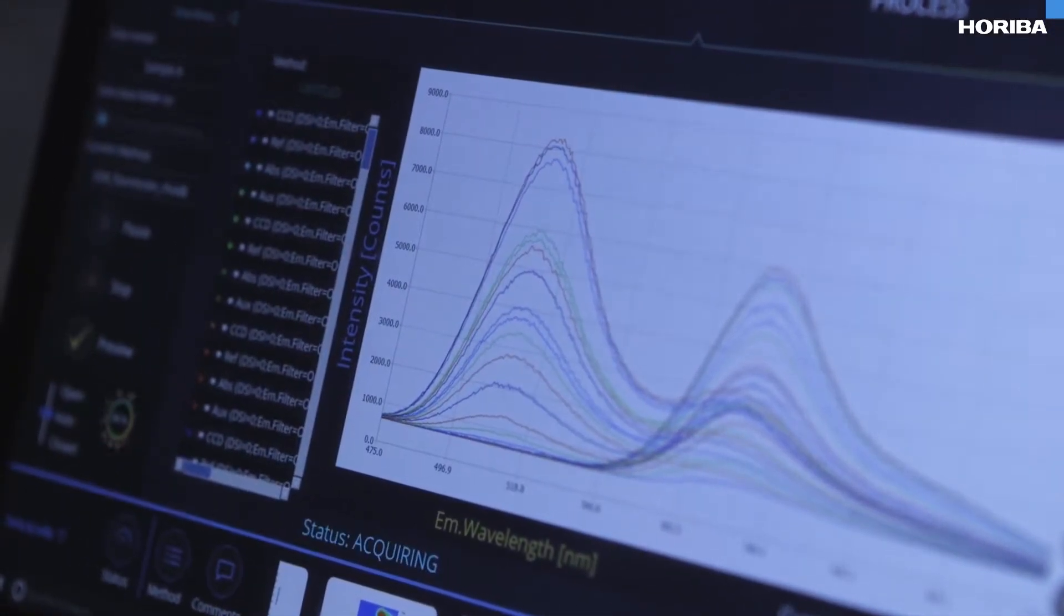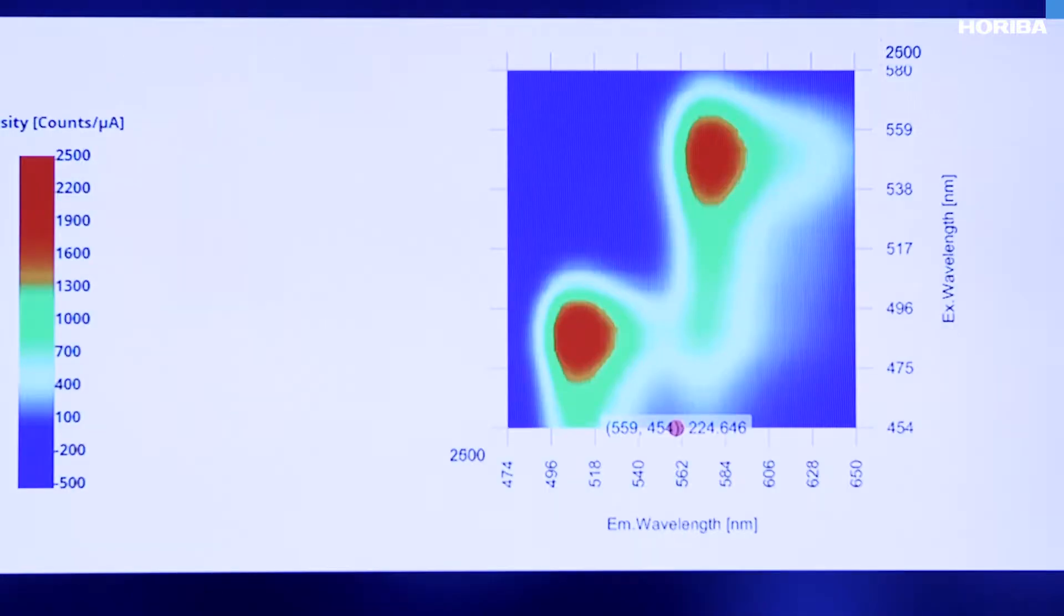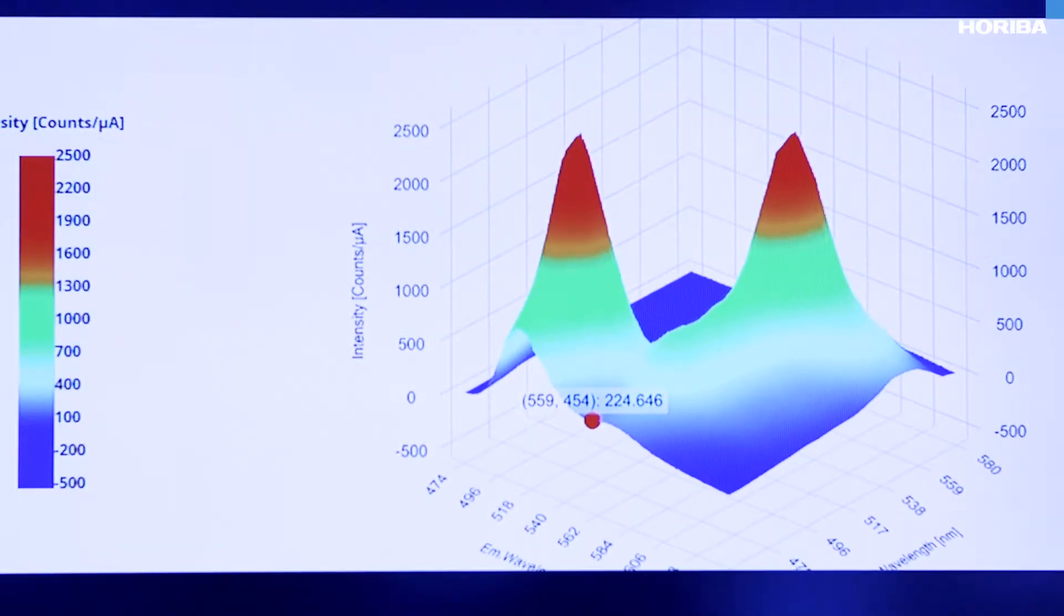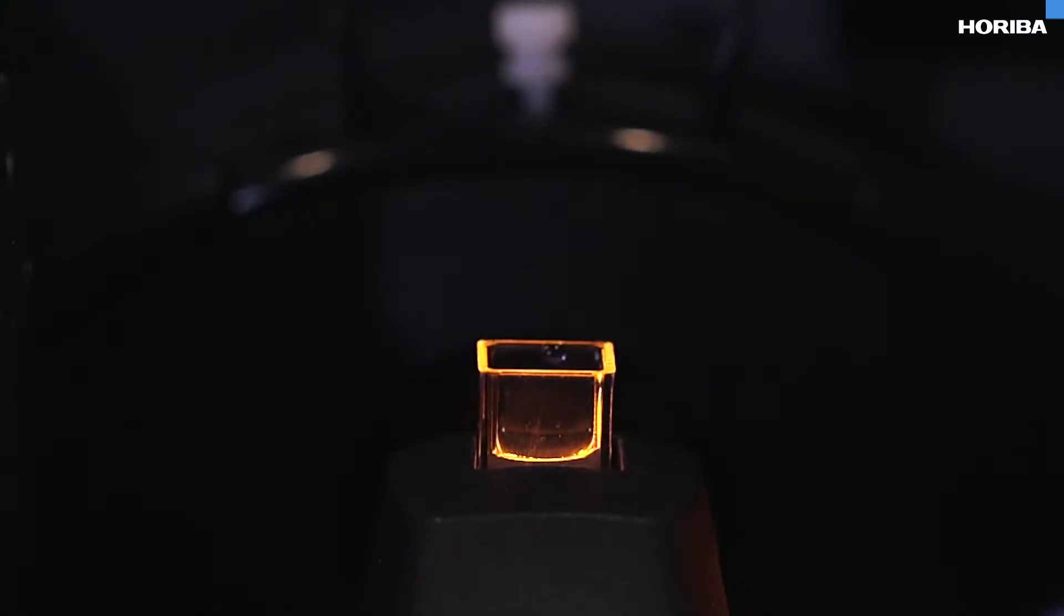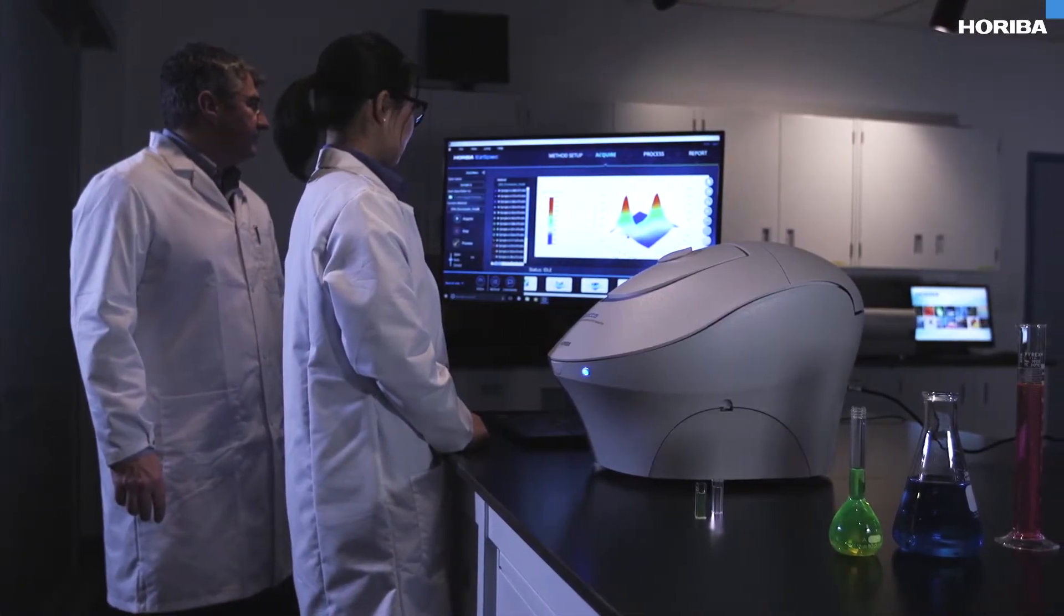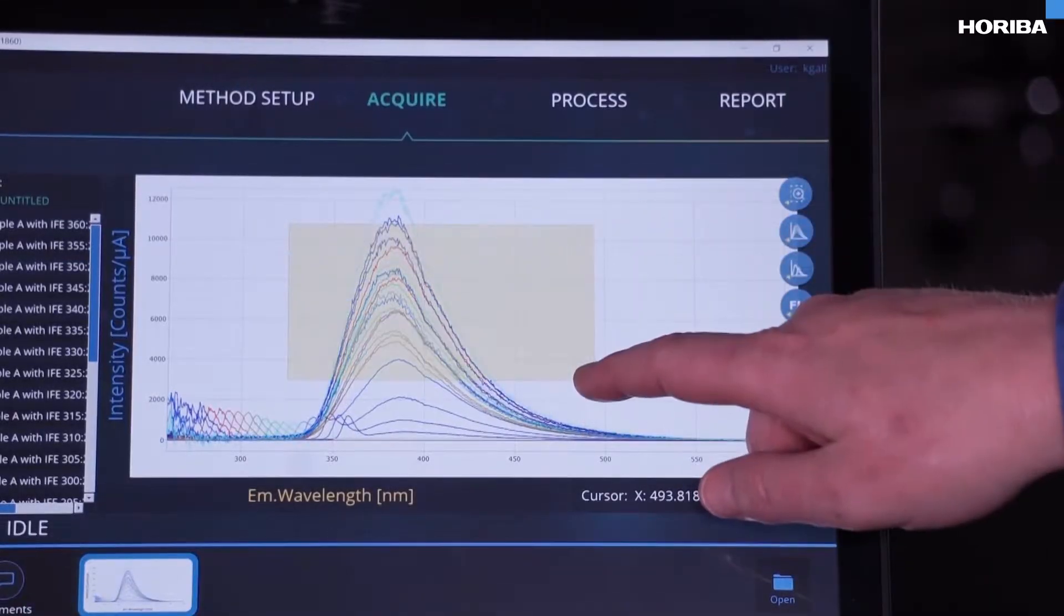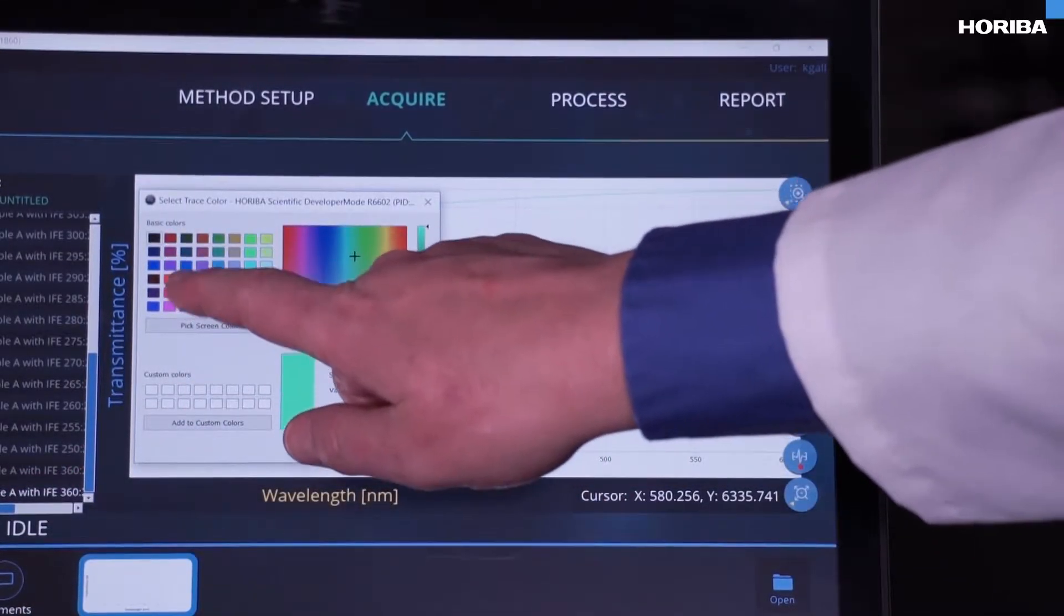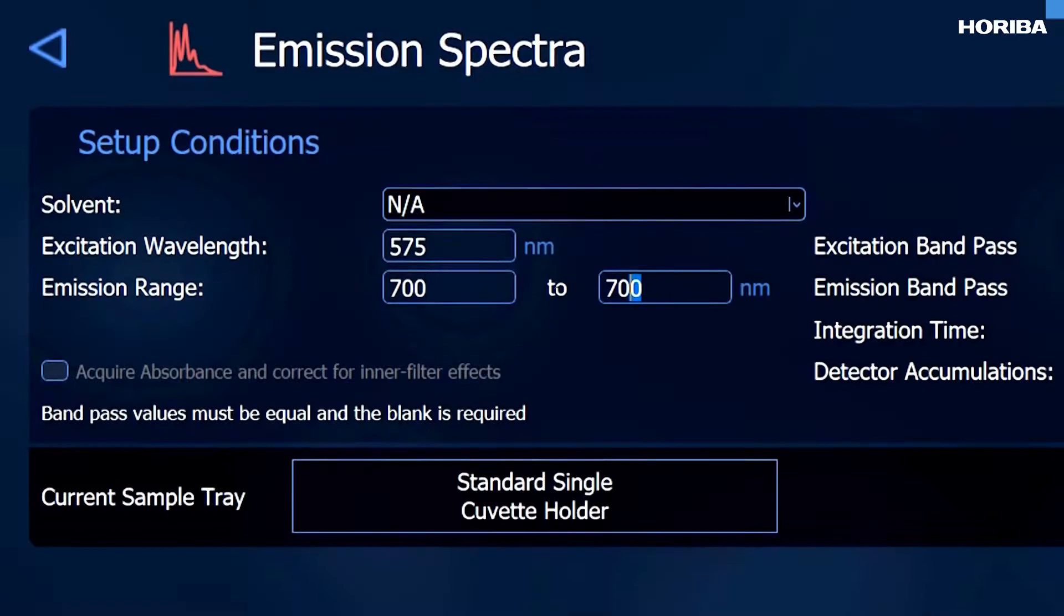Most benchtop fluorometers have an upper wavelength limit of, say, 650 nanometers, and some can be extended to 900 nanometers as an optional extra. With the Duetta, another benefit of having the CCD detector is the extended wavelength range to 1100 nanometers as standard.